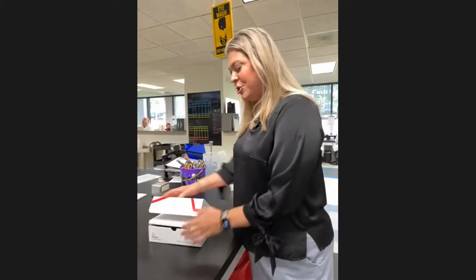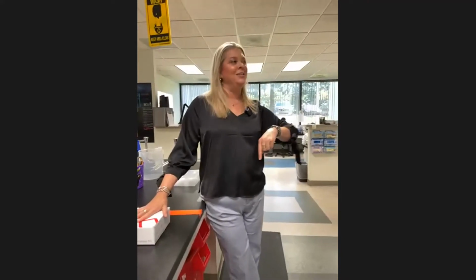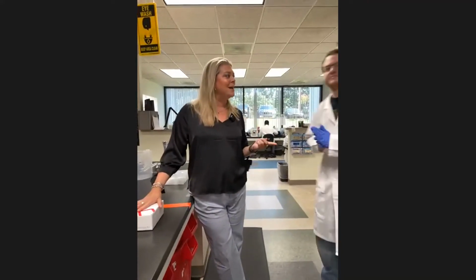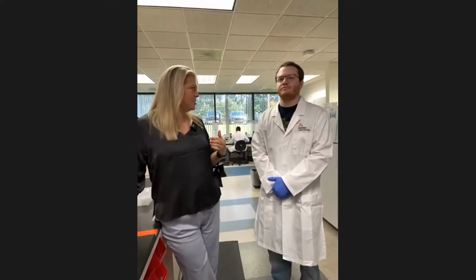So like Dr. Larsen mentioned, everything that is done today will be overnighted to our lab here in Little Rock tomorrow morning. And so they will all come here, and then we begin the process with something called grossing and accessioning. And I'm going to bring in John. John here runs our grossing and accessioning area. So John, tell us a little bit about what happens when the packages get here this morning.